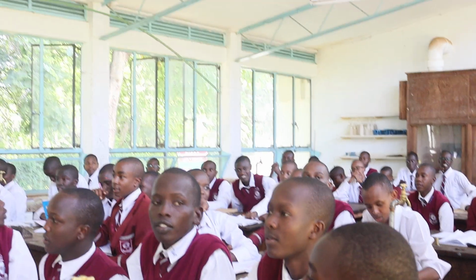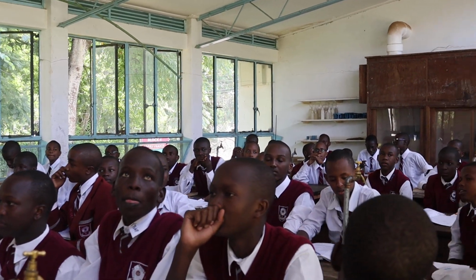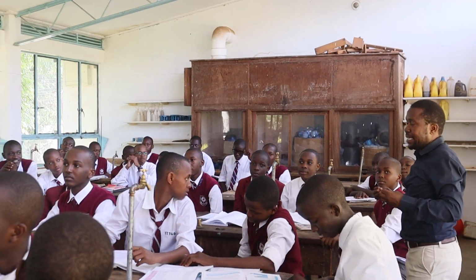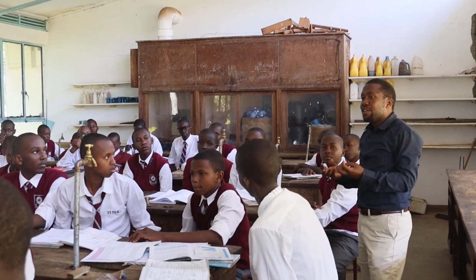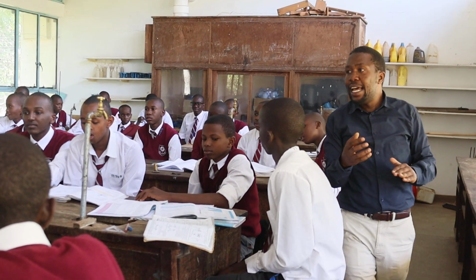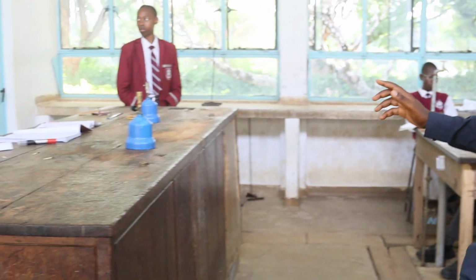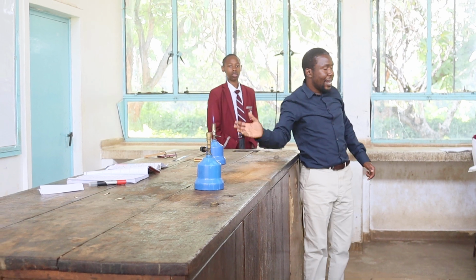It is non-luminous flame. What does non-luminous flame mean, class? It doesn't produce light. In other words, non-luminous means non-light. It does not have light. And if you observe very well, you don't see any light, isn't it? You don't see any light. You only see blue color. I want you to observe very well. Can you observe very well? There is no light.